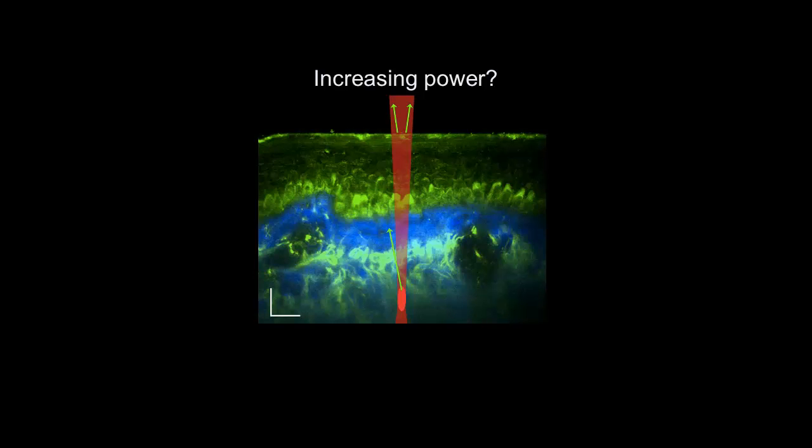The other thing that I'm seeing is that if I look at this structure relative to this other structure on the left, it looks like the resolution is degraded more here than here. That could be because something is happening up here that's different, meaning that there may be locally some more scattering up here, which is preventing the confinement a little worse in this portion of the sample. So it's not like the resolution cuts off uniformly across the whole sample, but it's actually spatially varying. Very true, because it's accumulation of scattering along the whole axis of the beam propagation.